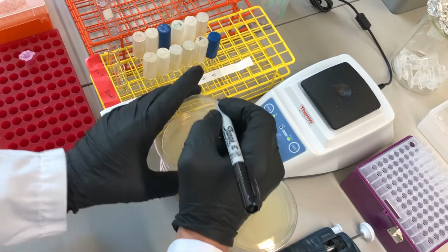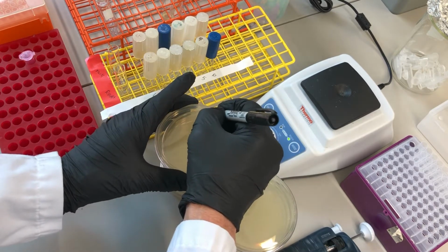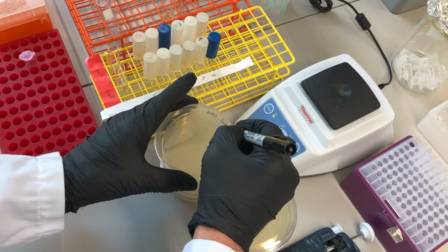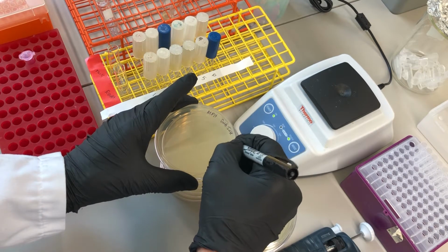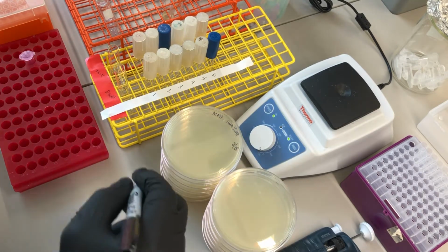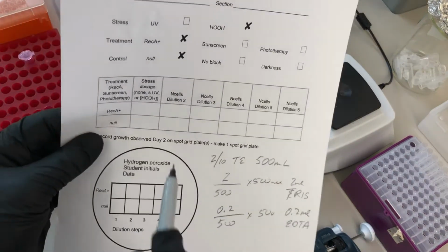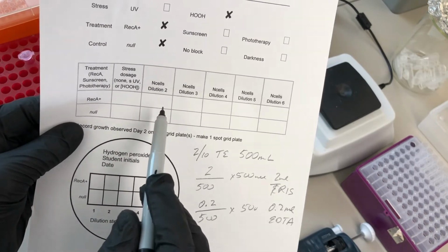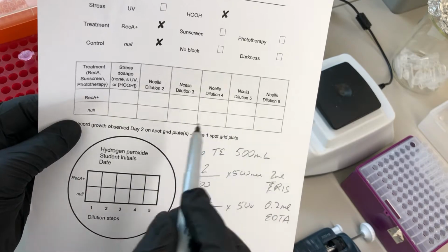And the plate labels will be my initials, my section, DNA instructor, and today's date, and then the condition. And I can look here on my data sheet. I'll need 5 plates for Rec A positive, and then the dilution steps 2, 3, 4, 5, and 6.